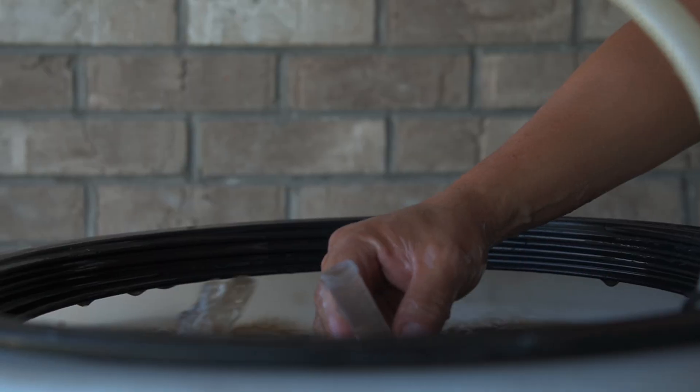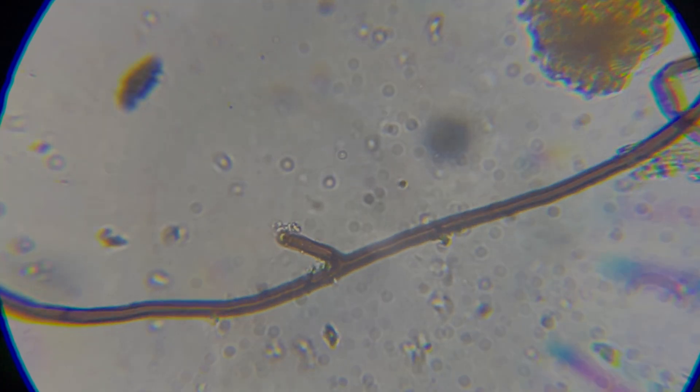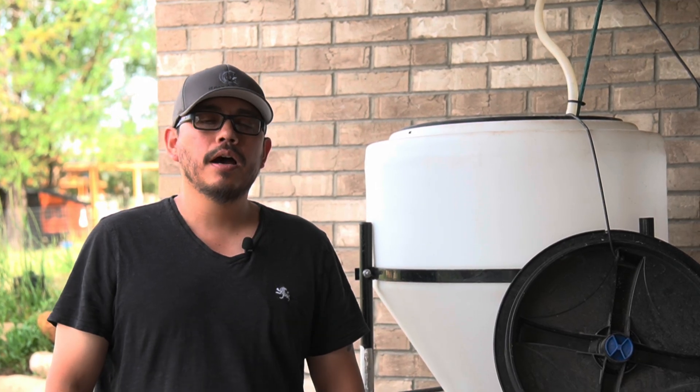On today's episode, we're going to take a liquid sample of compost extract and view it under our microscope, and then we're going to take a brief assessment of the quality of our material once we're done. I'm Kay the Guy, Certified Soil Food Web Consultant.